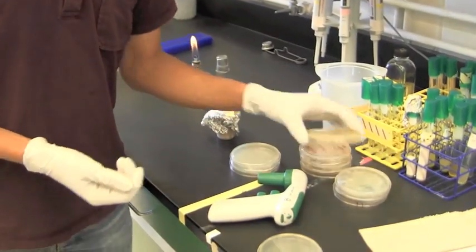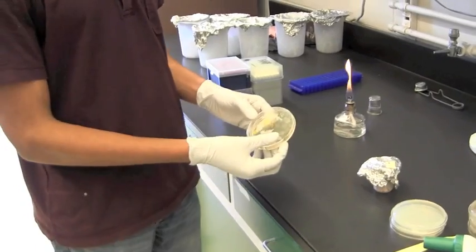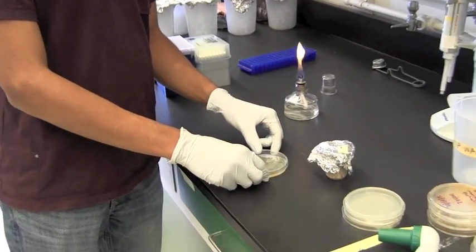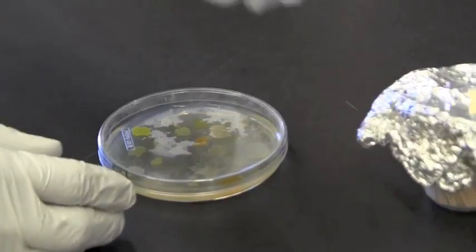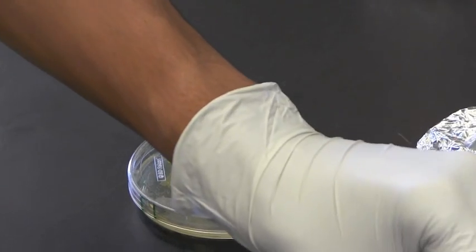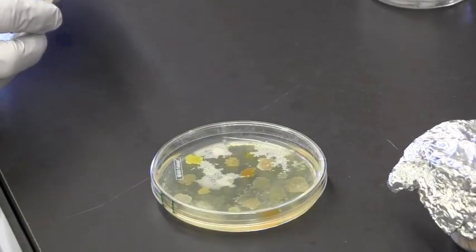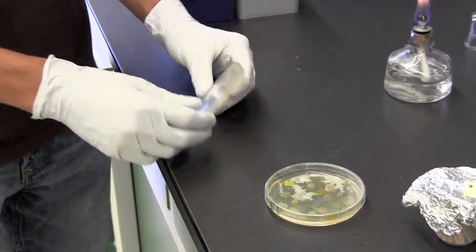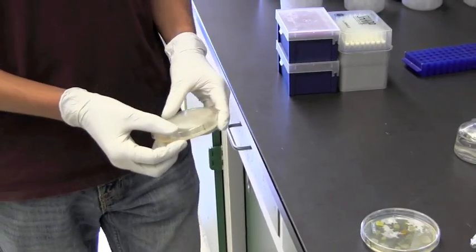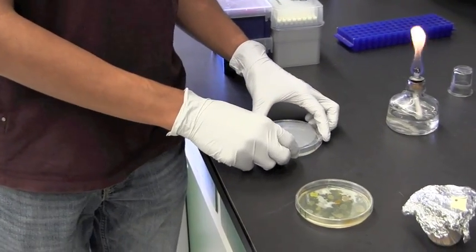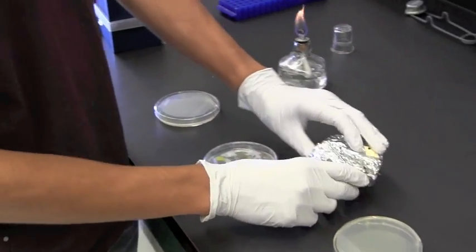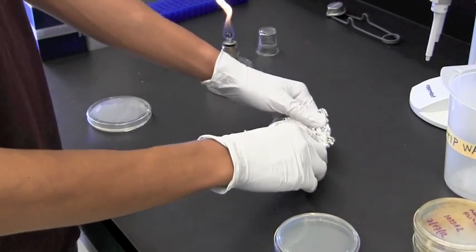So what we're going to do is pick our bacteria from a master plate which contains all of our soil isolates or wherever you got your isolates from, and we're going to spread these out by picking with a toothpick onto a clean agar plate where these cells will grow overnight or over the next couple of days.